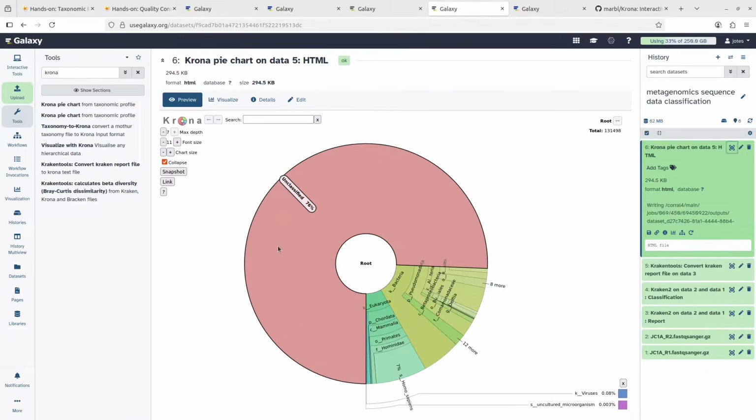And here it gives us the classification and also lets us know the proportion of sequence reads that were assigned that label. And because we are dealing with a taxonomy, it also gives you the labels in a hierarchical manner: kingdom, phylum, class, order, etc. All those outputs will depend on what Kraken gave, because this is essentially using output from Kraken. So what is in Kraken is what is reported here in Krona. So just take note of that.